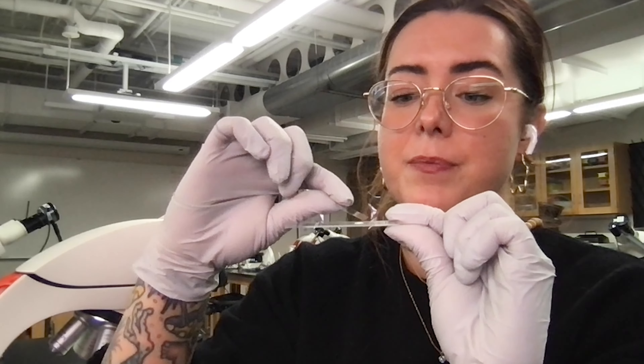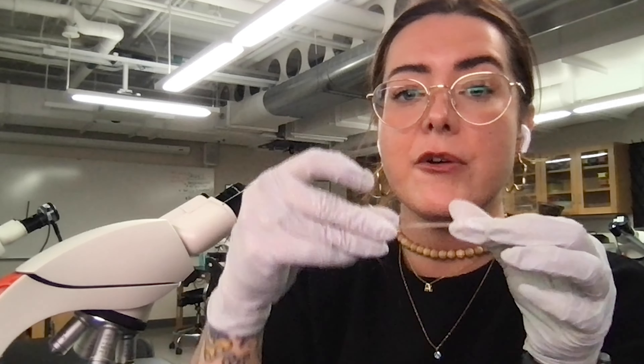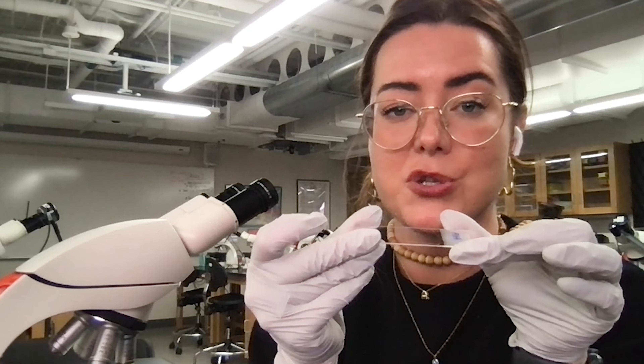Here, this is your cover slip. Slap that down right on top of your droplet there, maybe give it a little tap, and now you're ready to go ahead and put this onto the microscope and observe your specimen.